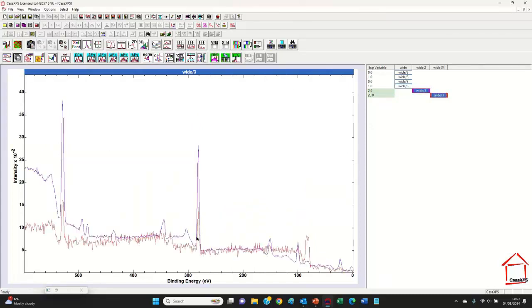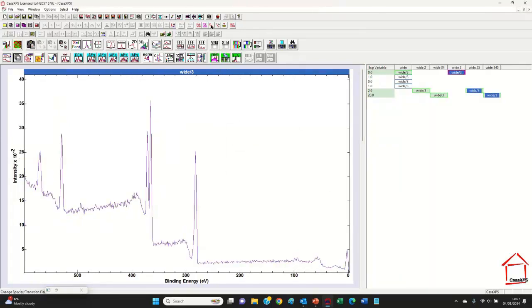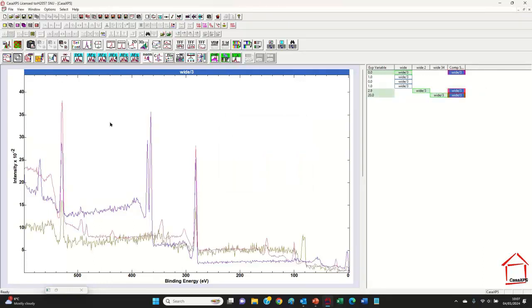One is now pure gold, the other is mostly the glass, and the third piece of this jigsaw is the silver. So I've now got three component spectra that I can organize and make use of to fit the spectral pixels of the entire data set of images.